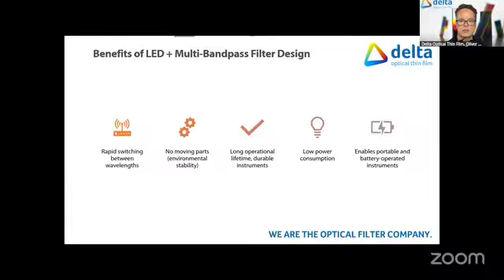All the components, filters and LEDs, have very long operational lifetime, so very durable instruments, also reducing cost of ownership. They have low power consumption, so it's now possible to also make portable battery-operated instruments. That's not that relevant for fluorescence microscopy, but for clinical diagnostic tools, that's quite nice to make it more compact than was possible before.